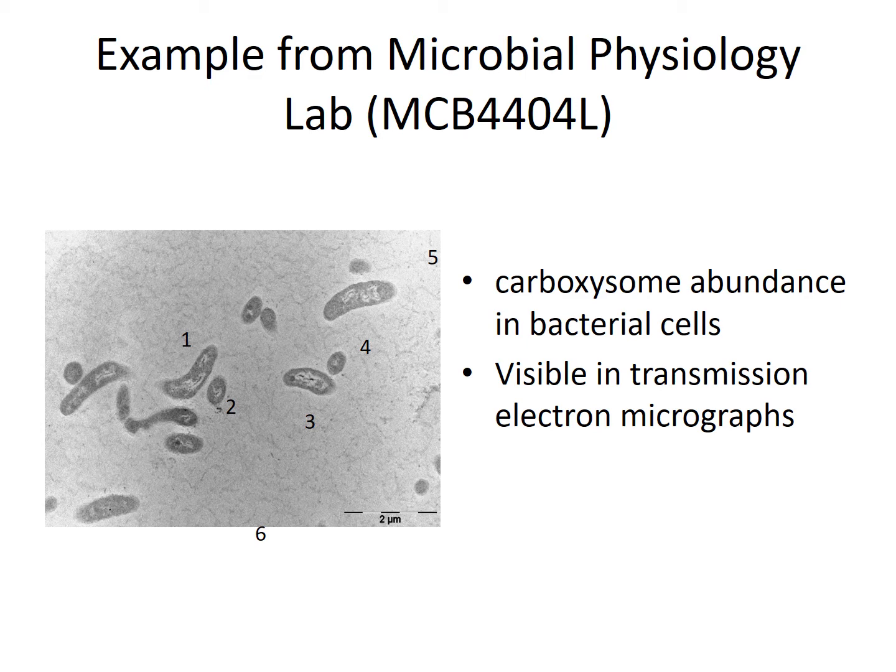carboxysomes in bacterial cells. So what I did was I collected a whole bunch of transmission electron micrographs for this project. Now the image analysis project that I'm describing here was done on electron micrographs, but it could really be done at any sort of collection of any sort of image.